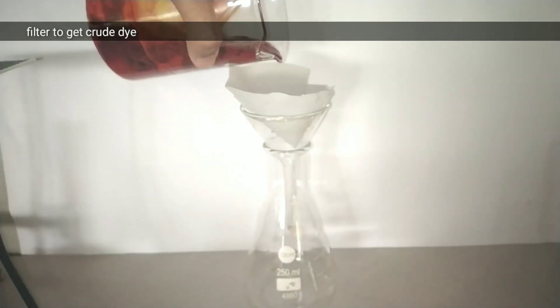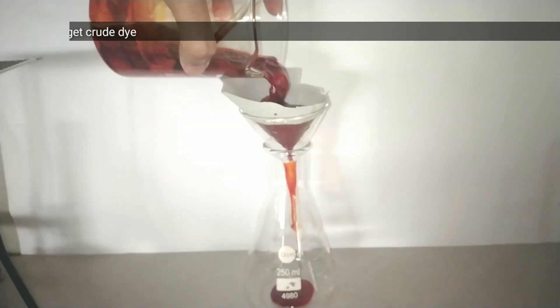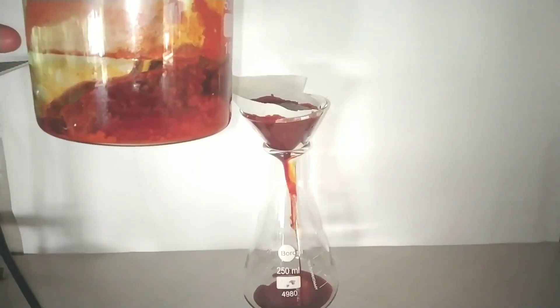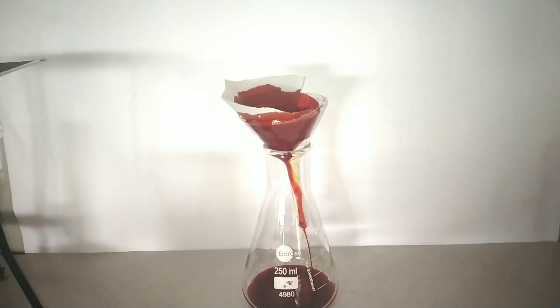Now to start the purification process, I will first do a filtration to get the crude dye. I am using a simple gravity filtration here. If you want to complete your filtration process faster, always do a vacuum filtration.